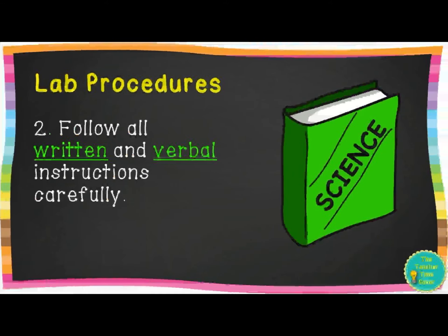The next rule is to follow all written and verbal instructions carefully. Written means stuff that's written down — I might give you a procedure list that you have to follow to make your crystals. Verbal means instructions that I tell you, words that I say to you. So whether it's something written or something I tell you in person, you have to follow what I say when you're doing the lab.